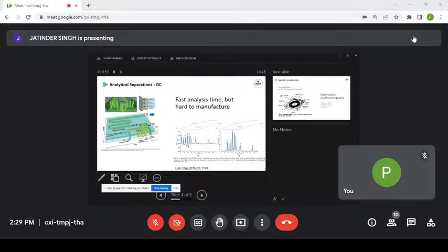Some of the very earliest microfluidic work was trying to do gas chromatography on a chip, and this is a little bit more advanced. This is a 2015 example. Instead of buying a GC column, which is typically a coil of fused silica capillary that looks like a brownish hair, a couple of meters long and hollow.